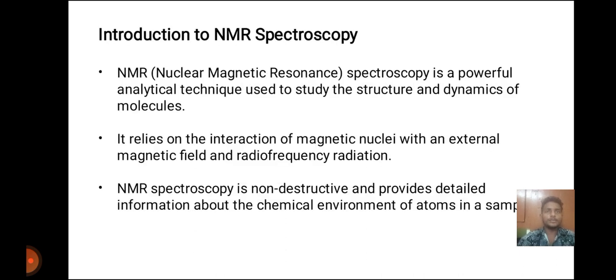Introduction to NMR spectroscopy. NMR, nuclear magnetic resonance spectroscopy, is a powerful analytical technique used to study the structures and dynamics of molecules. It relies on the interaction of magnetic nuclei with an external magnetic field and radio frequency radiation. NMR spectroscopy is non-destructive and provides detailed information about the chemical environment of atoms in samples.